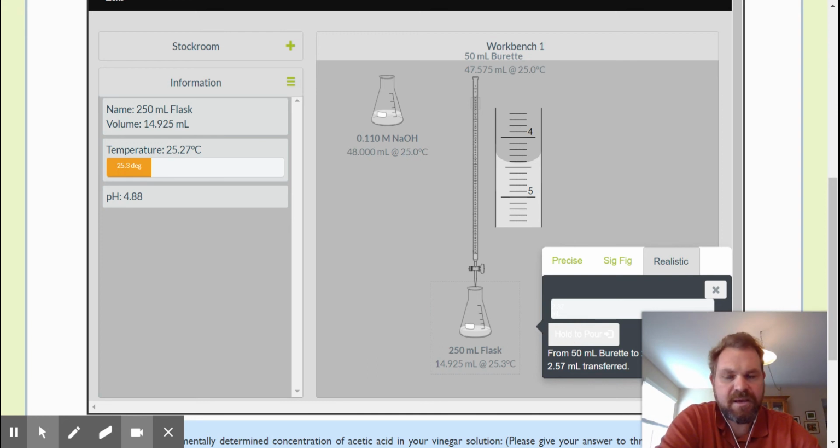Okay, you can see over here too on the left that the pH is going up slightly. Okay, kind of just keep adding little by little. I'm just adding like drops, essentially like 0.5 milliliter maybe, or a tiny bit.